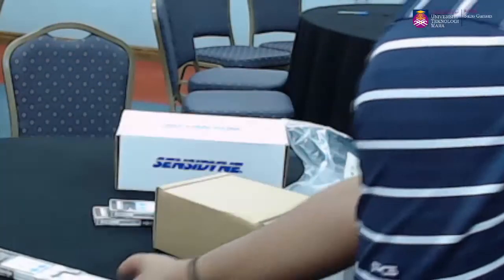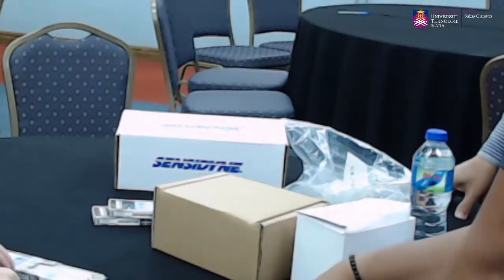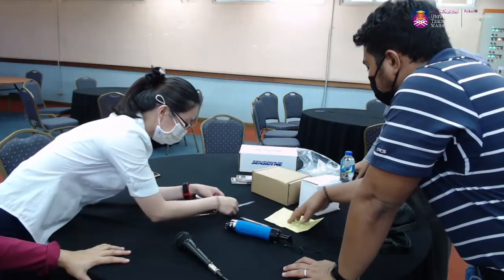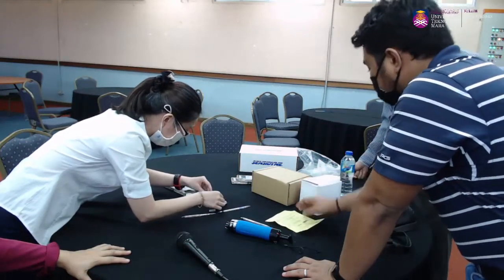Okay, now. Alright. So daripada sini kita akan tengok perubahan color dia daripada putih ke brownish, brownish orange color. Itu kalau ada detect formaldehyde. Kalau tak ada, means tak ada formaldehyde dalam area ni.